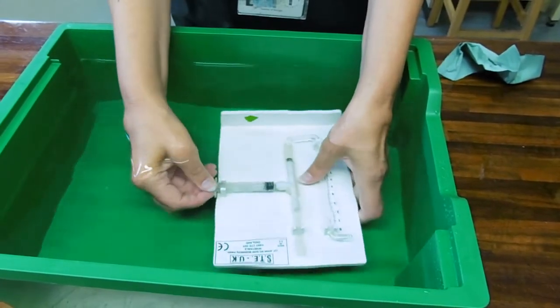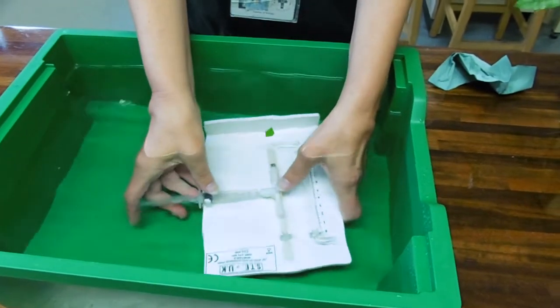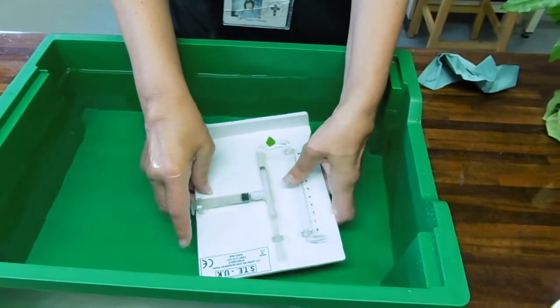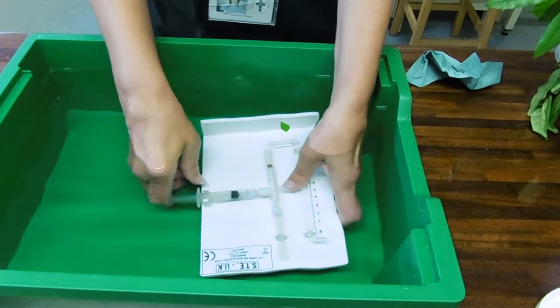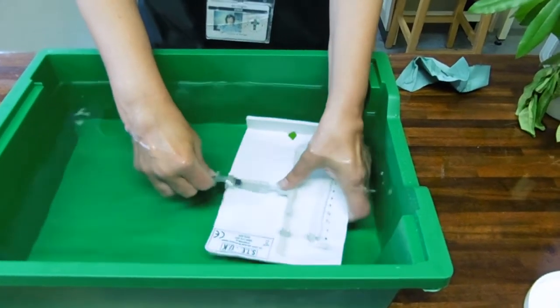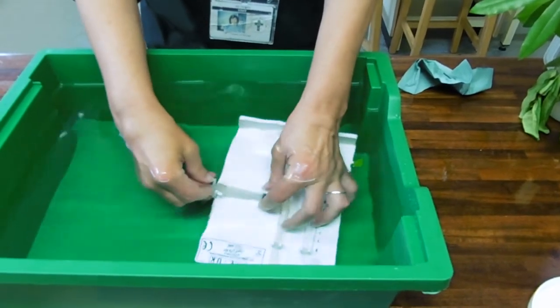This is where most of the problems with photometers lie, because if they are leaking at all, if their joints are not sealed — we've got quite a few bits of flexible tubing — they tend to trap air in them, and that makes it not work. They're fiddly to set up. I feel like a mermaid trying to do things underwater.